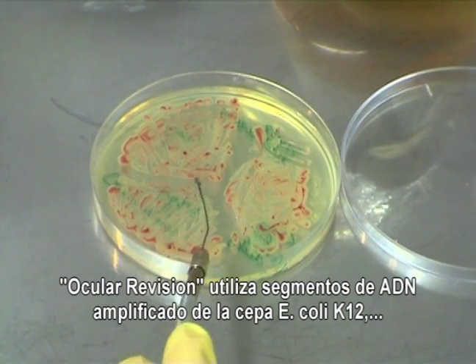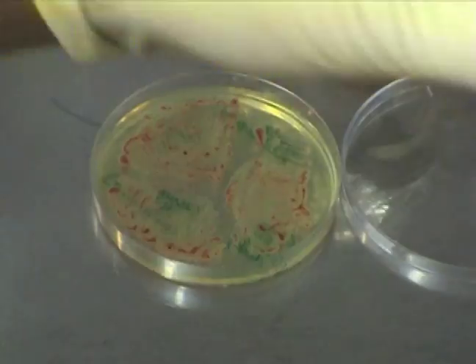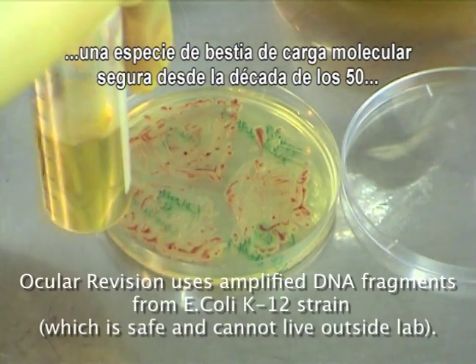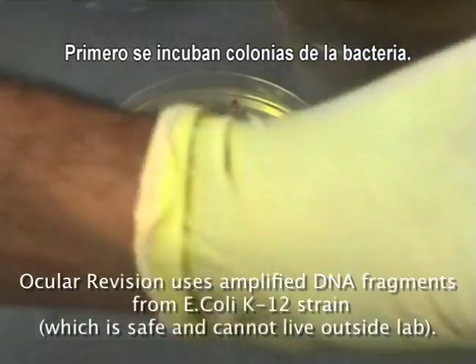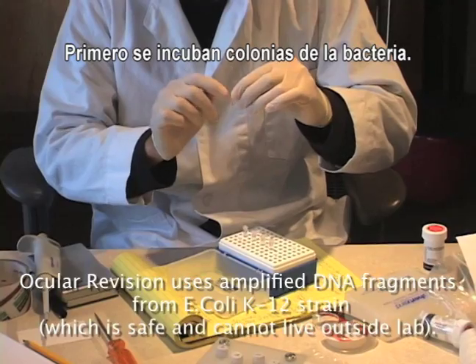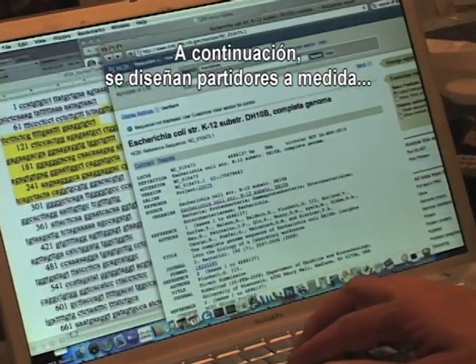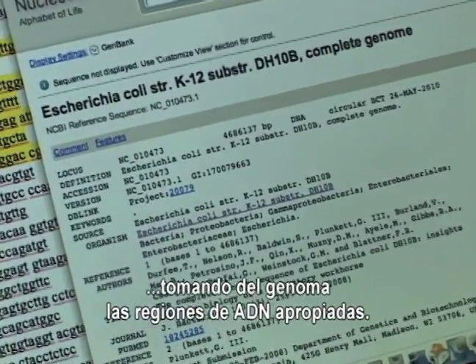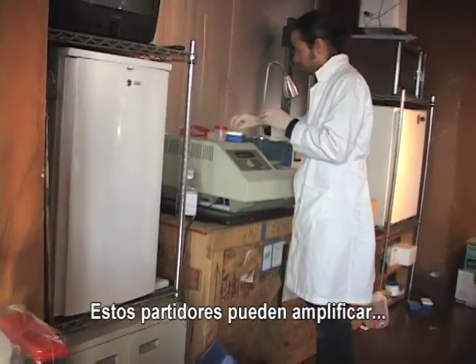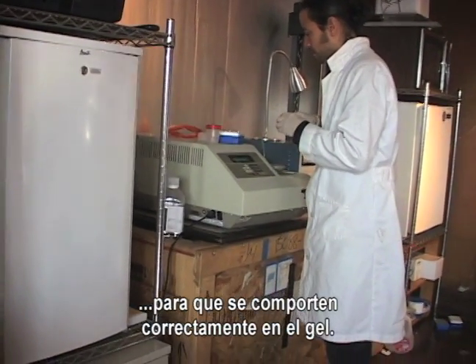Ocular Revision uses amplified DNA segments from the E. coli K12 strain, a safe molecular workhorse since the 1950s which cannot live outside the laboratory. First, the bacteria is incubated into colonies. Then DNA is extracted and purified. Then custom primers are designed by targeting the appropriate DNA regions in its genome. These primers can amplify correct-sized fragments from the organism to behave correctly in the gel.